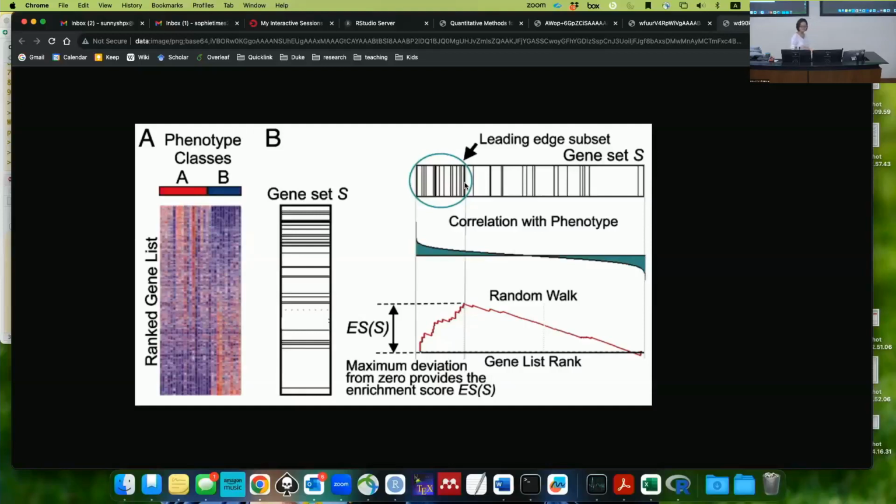To rank the genes, they use the input gene statistic. You can use fold change or test statistics or log 10 p-value. And that data will affect the weight of each step. Yes, the step size depends on this.